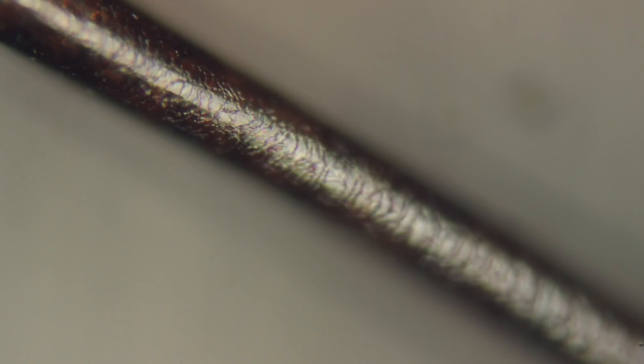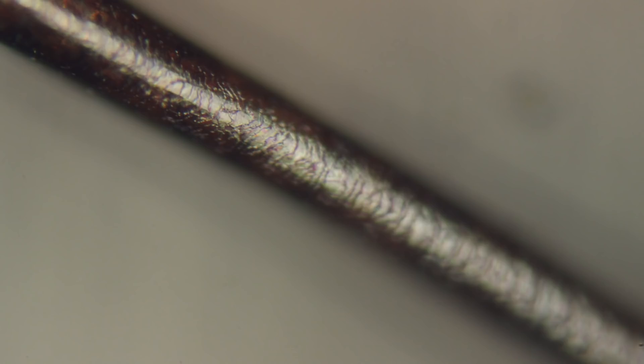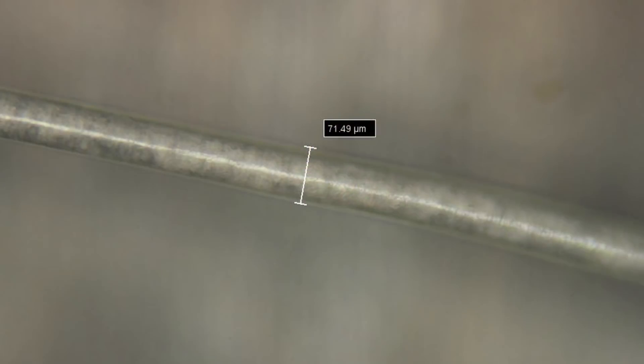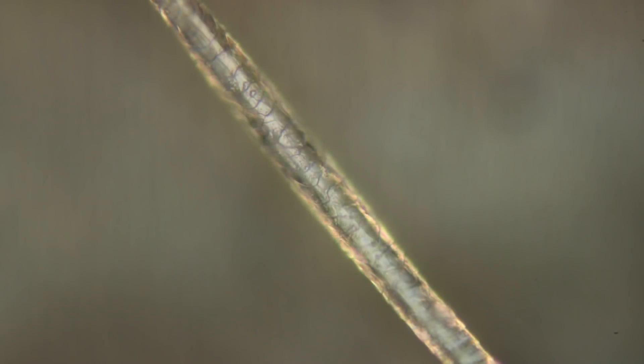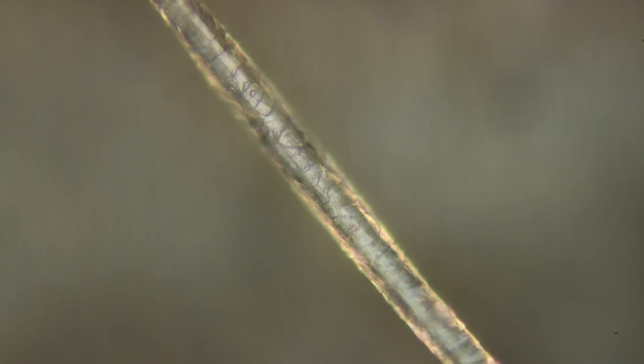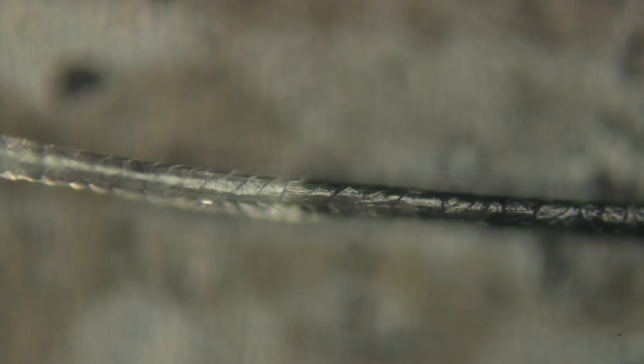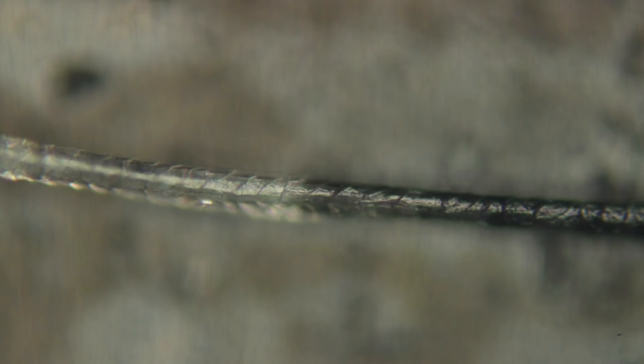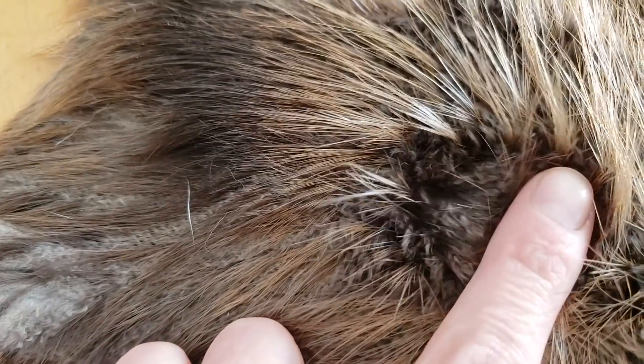Cat hair roots typically look a bit frayed. Skunk hair shows flat and small scales in the cuticle with pigment distributed throughout — this sample was from the black section of the skunk fur. Raccoon hair looks a bit like coyote, fox, and wolf hair and is banded in color; under the microscope you can see flattened imbricate scales and patches of pigment in the cortex, but it doesn't have the petal-like scales at the base like foxes. Sheep wool has a natural crimp and a rough scaly imbricate surface; if it's from a clothing sample, dye can be found within the cuticle.